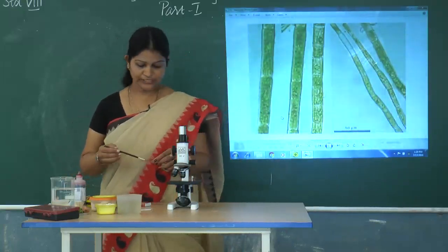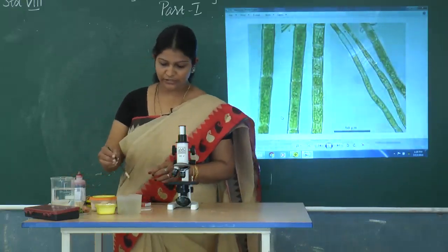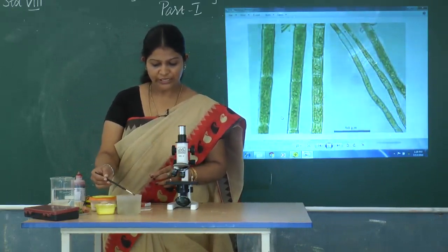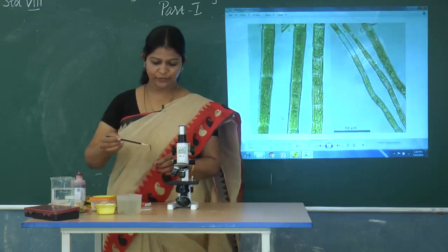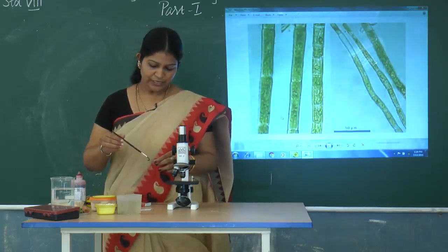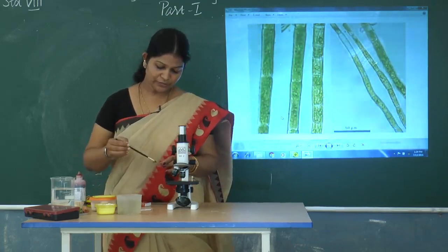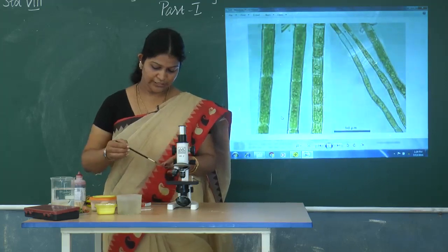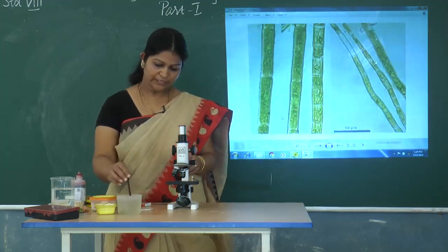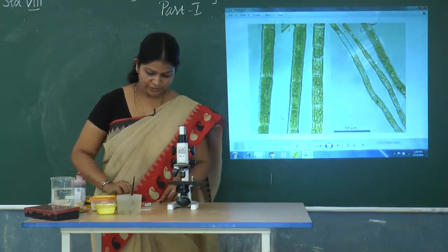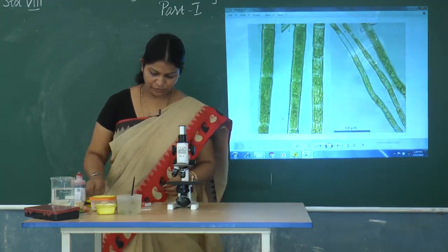Now we are going to do an activity on algae. To collect the algae, you have to take scrapings from the wall of any tank. You have to scrap a piece of algae, add a drop of water on the slide, put the algae scrapings on the slide, and then carefully place the cover slip over it.